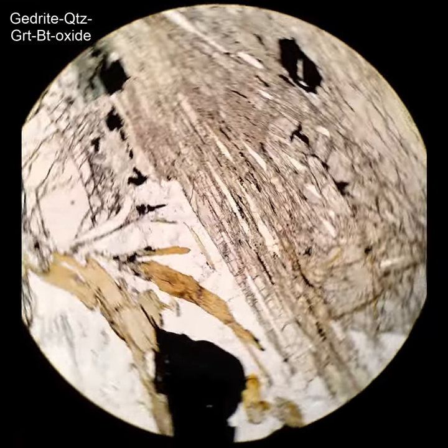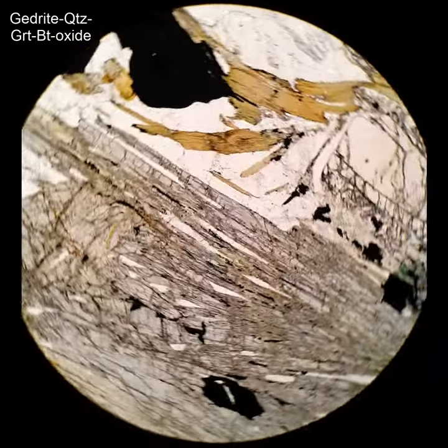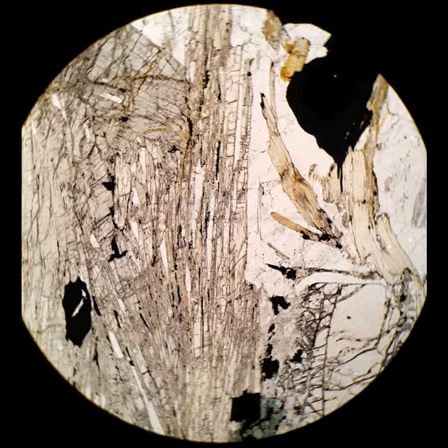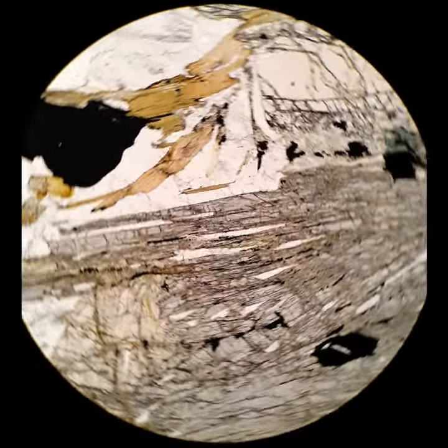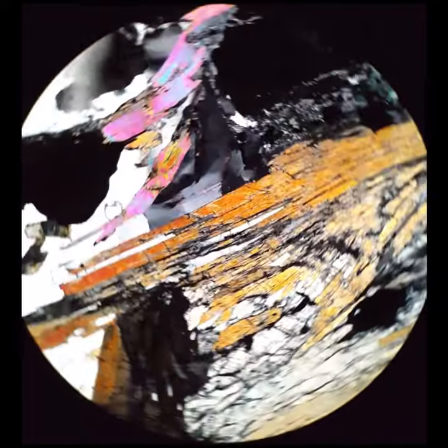Now this is more gedrite, a little more pleochroic. You can see it's darker when it's running east-west. Really nice needles, amphibole habit, moderate relief — it's clearly higher than the quartz that's in the thin section. That moderate relief is also characteristic of amphiboles.